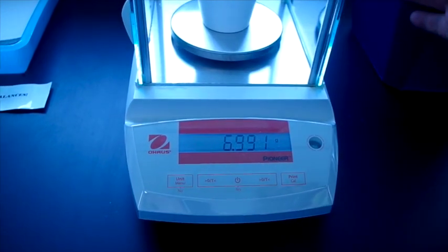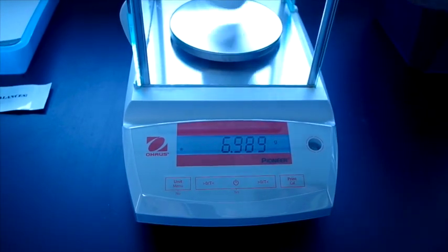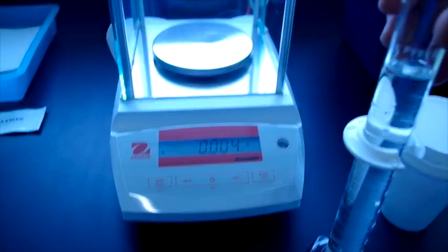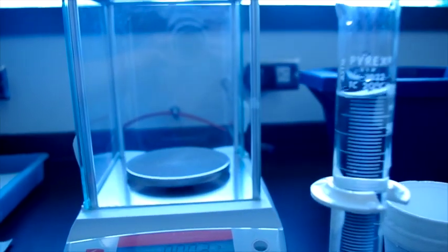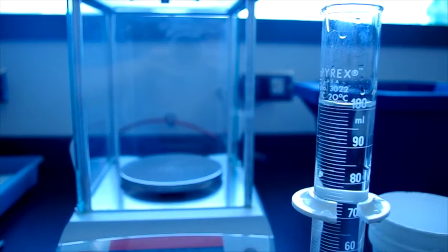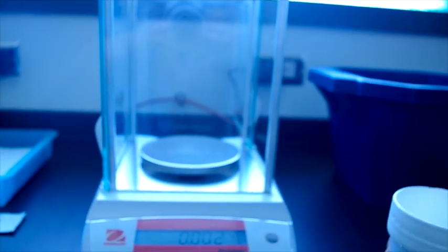Alright, now 100 milliliters, pour into the cup.